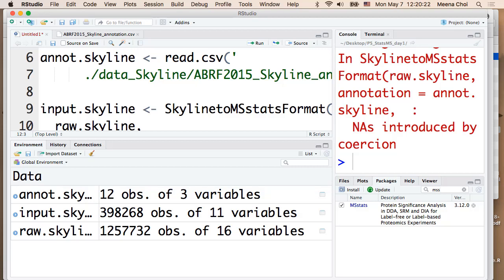Okay, 3.10.6. Yeah, I have a different one. I see. Got it. Do we need to update? It should, because here's the issue. Last week and this week Bioconductor has had some transition stage, so some computers have this version and some have that one. If you're early, yes, this is what I installed yesterday. If you try one more time, maybe it will be updated.